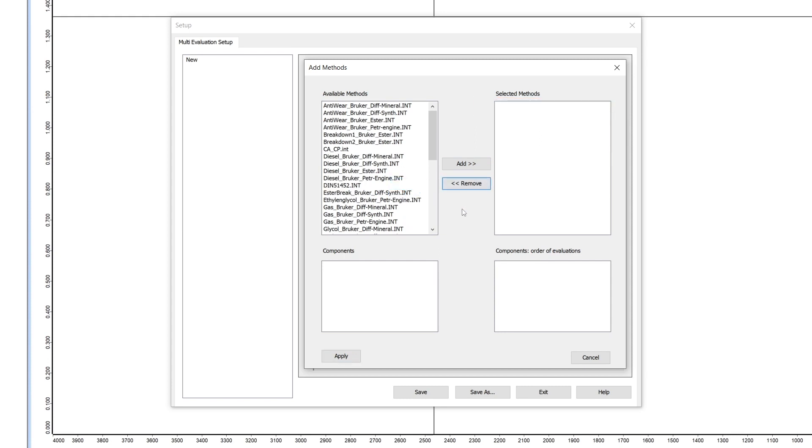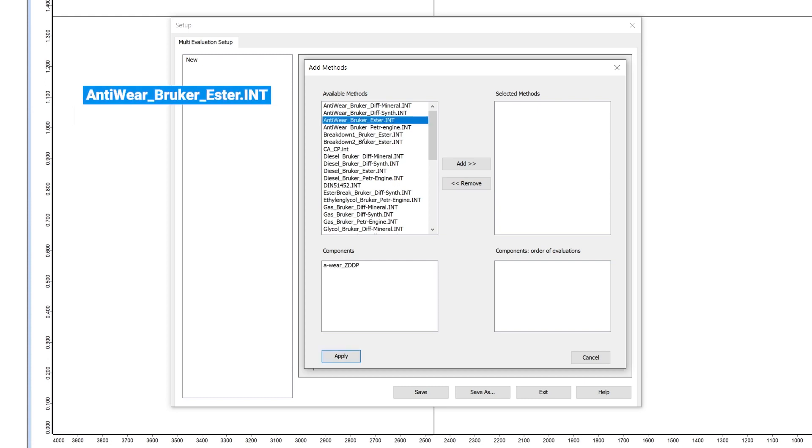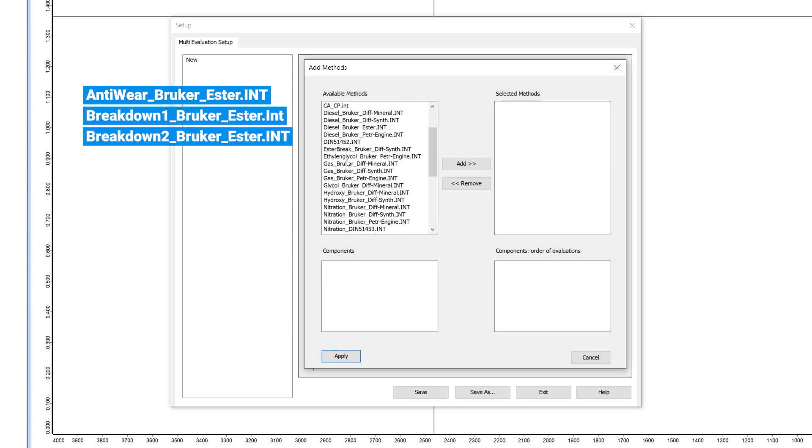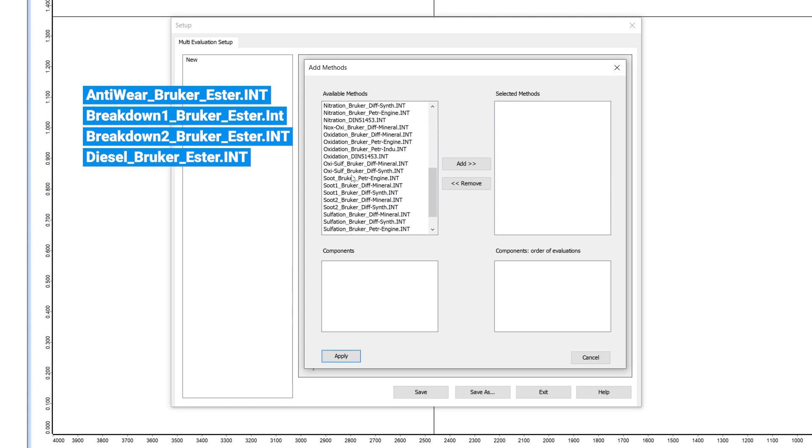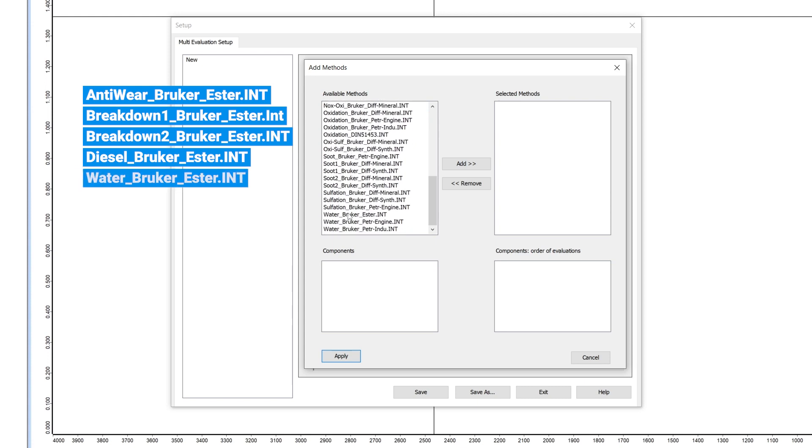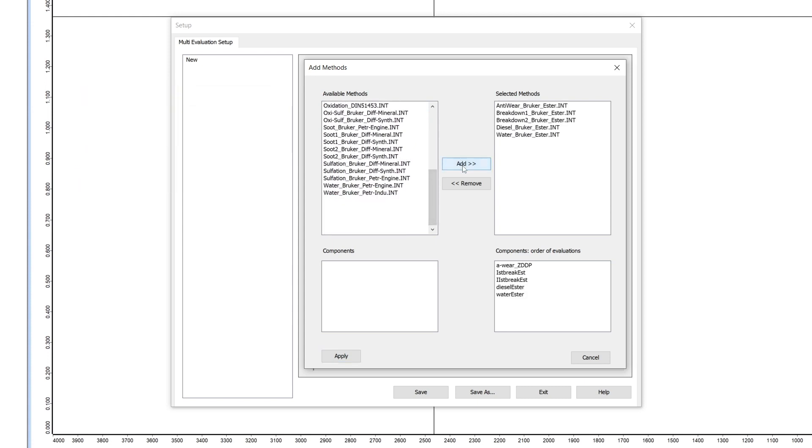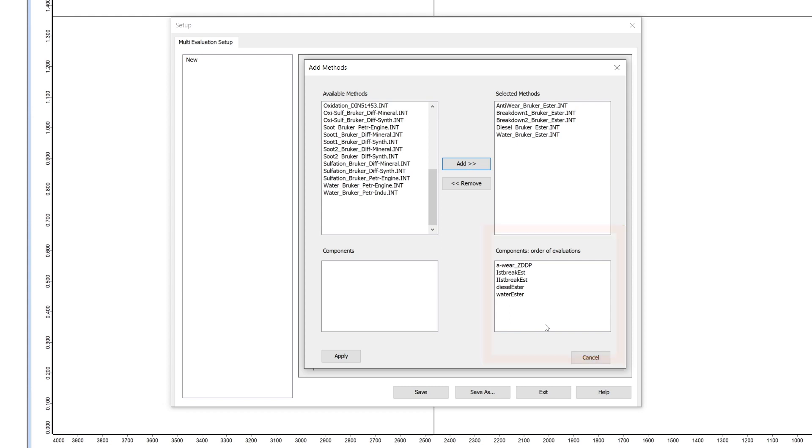We will create the MEV methods for eases in used oil. Our required methods are anti-wear, breakdown 1, breakdown 2, diesel and water. In the lower areas you see the components your methods include. After you added your required methods, press apply.